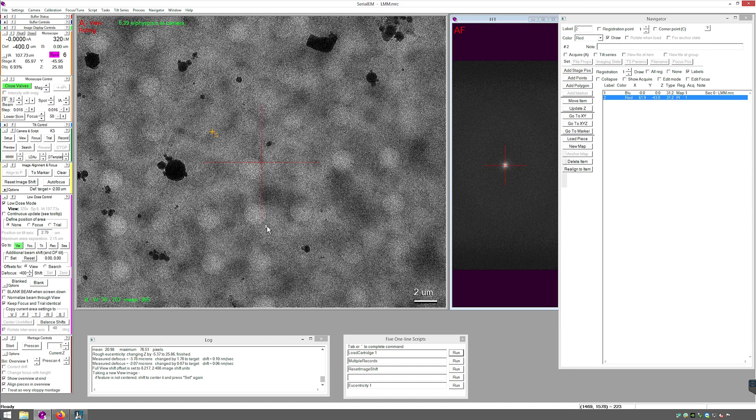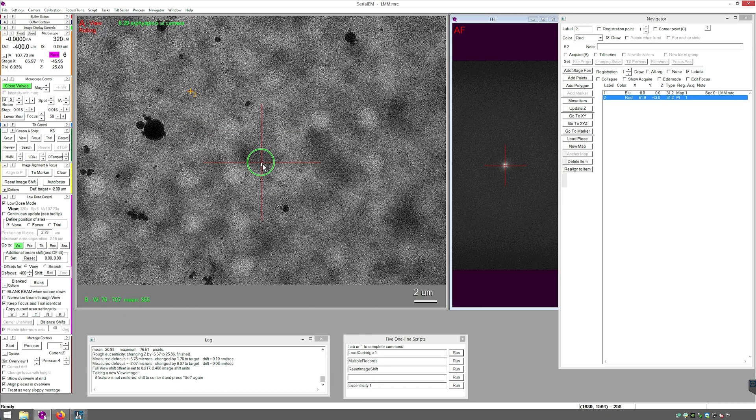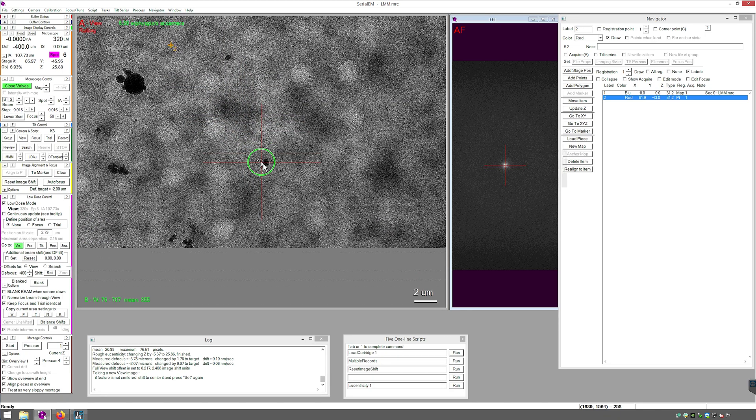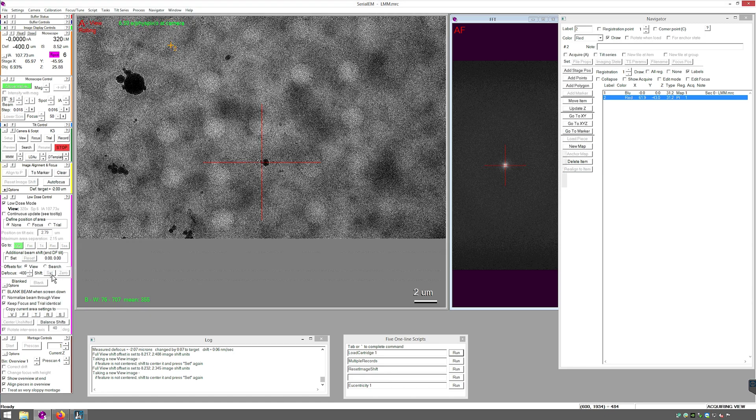Alright, and it's a large offset. So the feature I was at is in the bottom here. I know that for certain. I will right click, drag it to the center of the crosshairs. That will create an image shift. I'll release. You can see right here, image shift 8.52 microns. And then in low dose control, offsets for view, I'll click set.